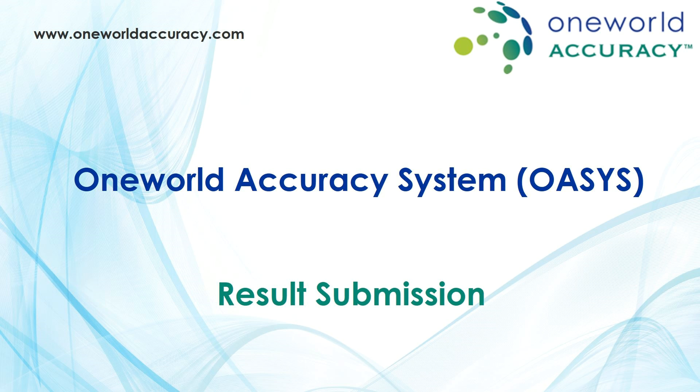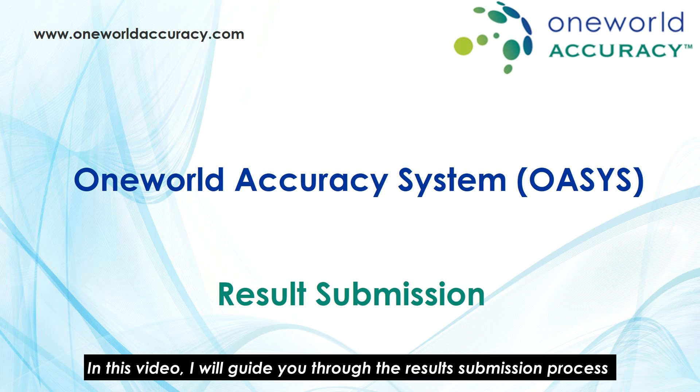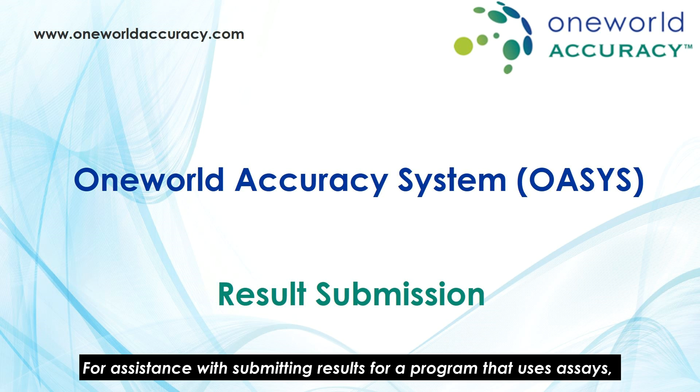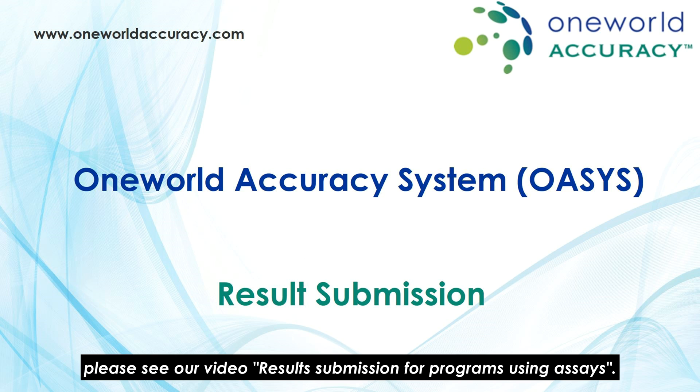In this video, I will guide you through the result submission process for programs that do not use assays. For assistance with submitting results for a program that uses assays, please see our video Result Submission for Programs Using Assays.